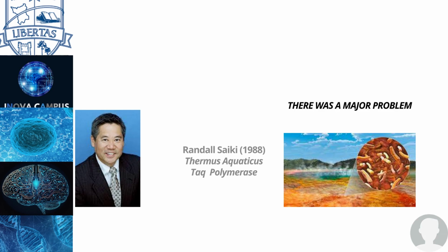This allowed the process to be faster and more efficient, because before it would take forever and fail many times, since the DNA polymerase wouldn't resist the high temperatures. And sometimes it's 95 degrees. There's no way our DNA polymerase can resist that.